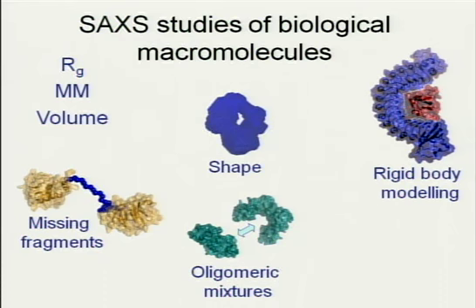This comes in very handy because if you have the models of trimers and tetramers, you can add them as well. And the program will tell you that you do not have any trimers there, just monomers, dimers, and tetramers, and in which quantities. Besides, you can vary the parameters, for example, the buffer conditions, to see if the amount of the oligomers changes or not.